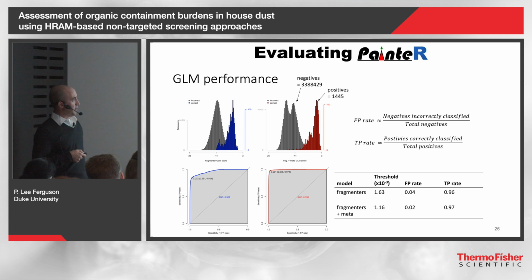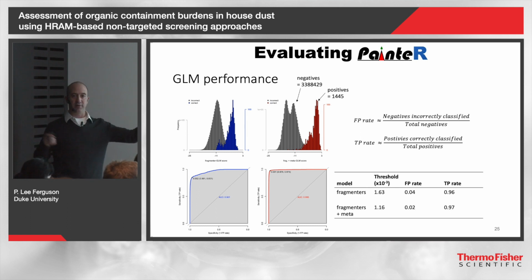When we include our metadata, for example the references, patents, and sources counts, we're getting about a 97% true positive rate and a 2% false positive rate, which sounds great, except when you look at how many true positives we had. There are 1,400 spectra, so there are exactly 1,400 correct answers. But there are not 1,400 incorrect answers.